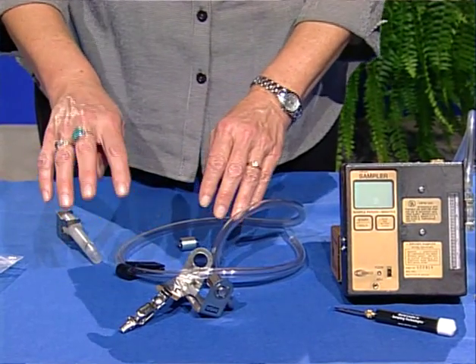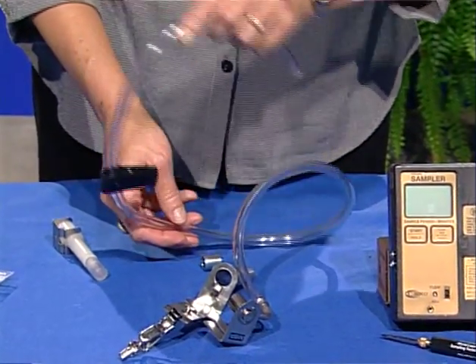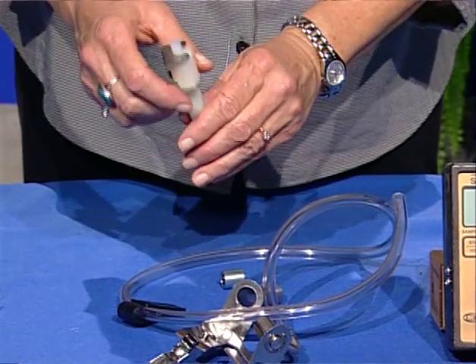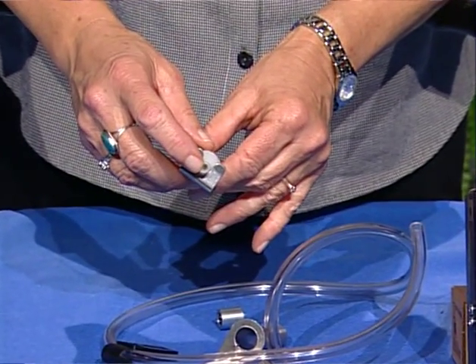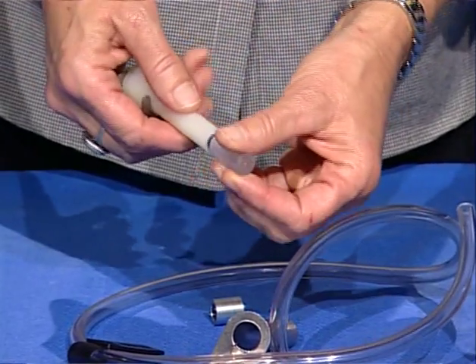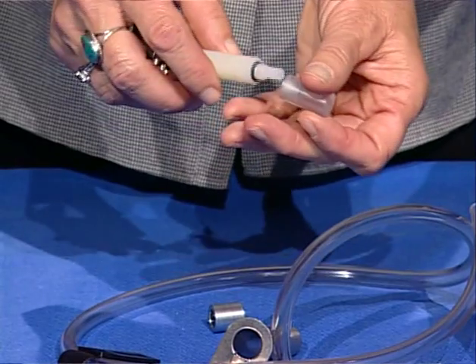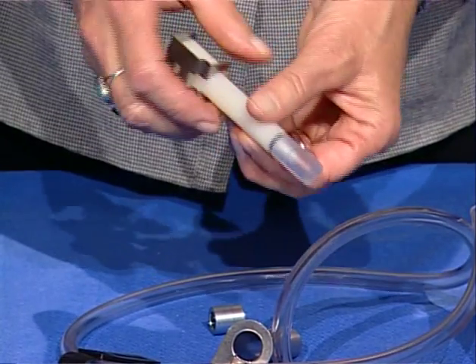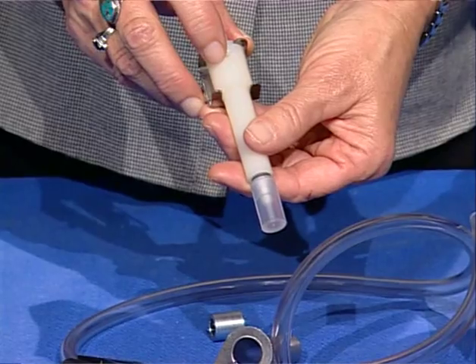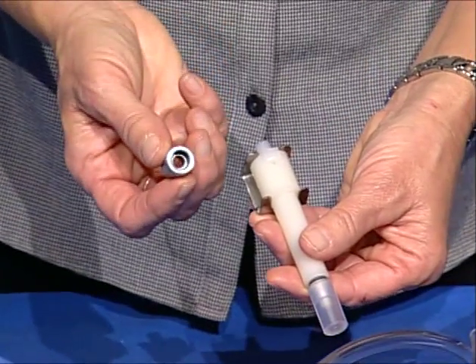The hose or tubing should be clear and free of holes. The inside of the nylon cyclone must be clean, dry, and free of scratches. The O-ring where the grit pot attaches must be present and in good physical condition. The vortex finder should fit snugly on top of the cyclone body. The O-rings in the barrel connector must also be present and in good physical condition.